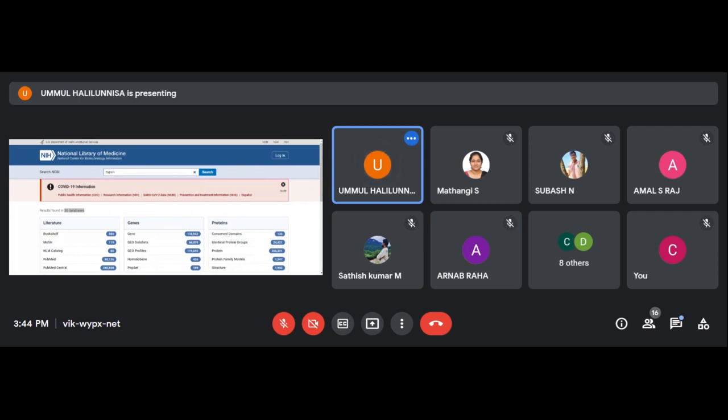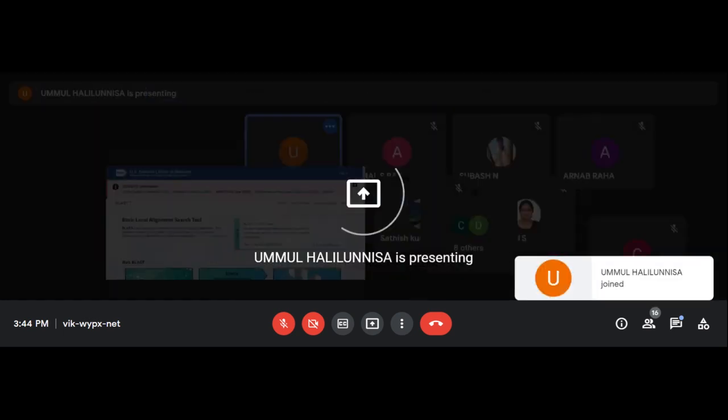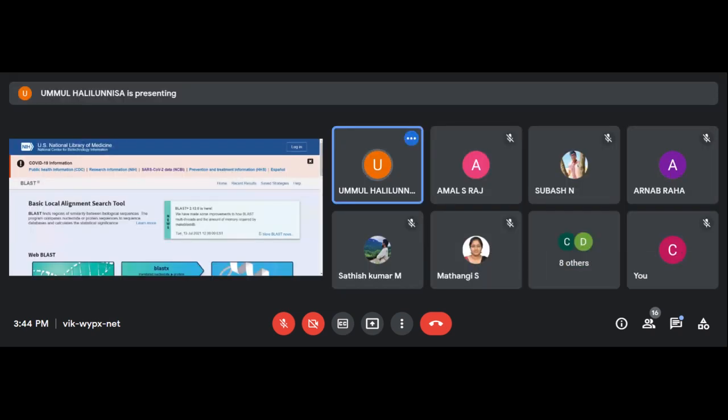Okay, now we'll go into the BLAST page. This is the BLAST page.